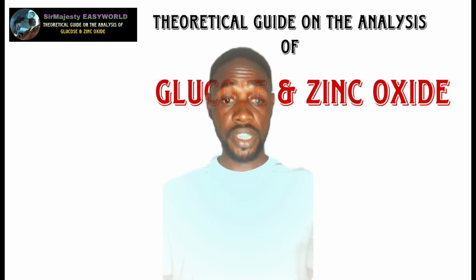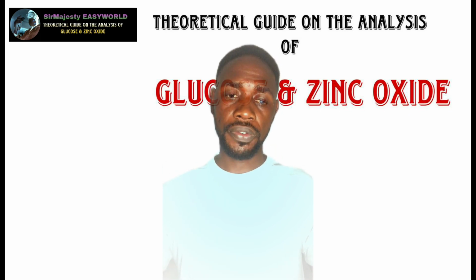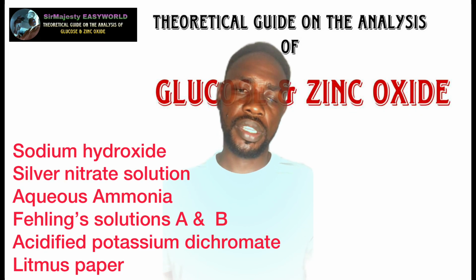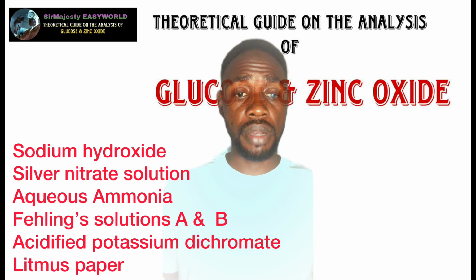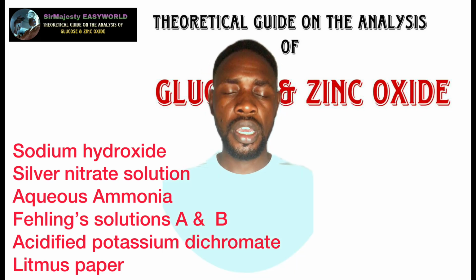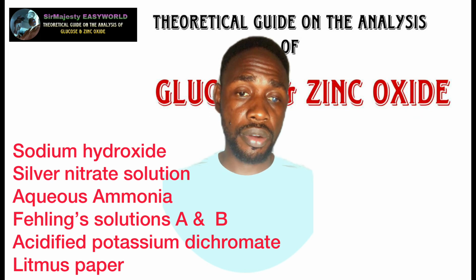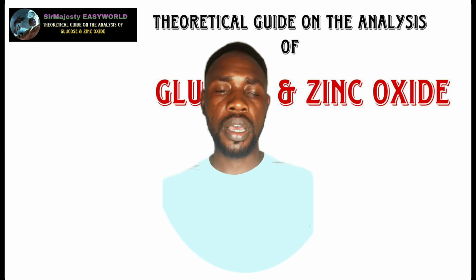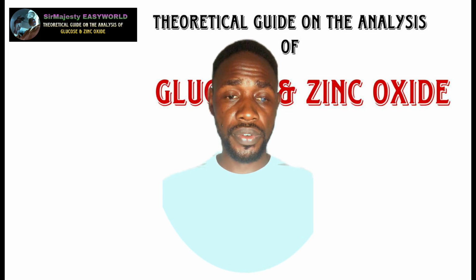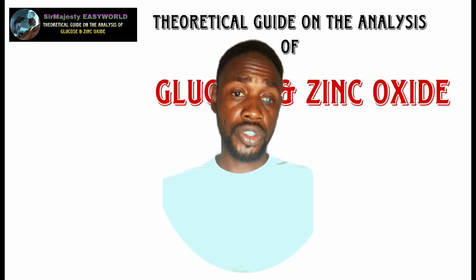then zinc oxide. First of all, you will be provided with reagents like sodium hydroxide, silver nitrate, aqueous ammonia, Fehling solutions A and B, then acidified potassium heptaoxodichromate(VI), litmus paper will be there. Then you need your apparatus for heating. The Bunsen burner is also required.